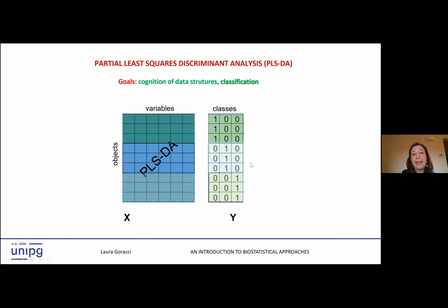Please remember, in case you are using software in which you have to type this data manually, this is the correct way to write it if you have 3 groups. You don't have to put 1 here, 2 here and 3 here, because they will be different numbers, or make only one line like 1, 2, and 3.